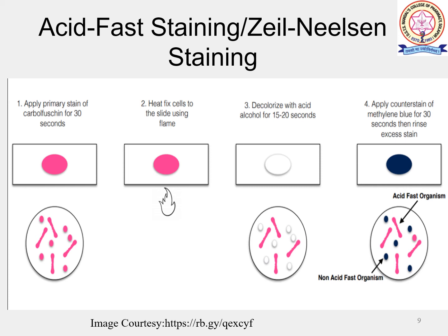Now the acid fast bacteria will appear bright red to intense purple red, straight or slightly curved rods. Singly or in small groups may appear. For non-acid fast, we have a blue color and the background material should also be stained blue.